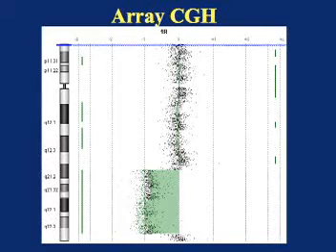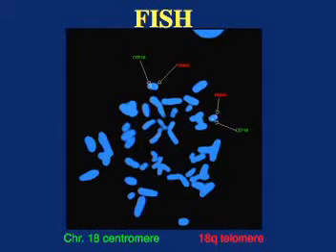It could be translocated to a different chromosome, or it could be attached to the upper breakpoint of the abnormal copy of chromosome 18. We cannot determine the location of that segment from a microarray experiment. The only thing we can learn here is about the net copy number change. However, now that we know just what region of the chromosome we need to test, we can use FISH to determine the location of that chromosome segment.